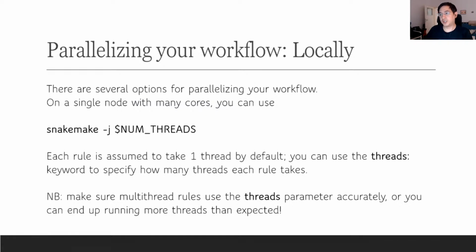We might imagine that we want to run 100 FASTQ files corresponding to 100 different RNA samples that we've collected the RNA from. So let's say we're pure bioinformaticians, and our wet lab biologists have created 100 libraries of some interesting data sets.